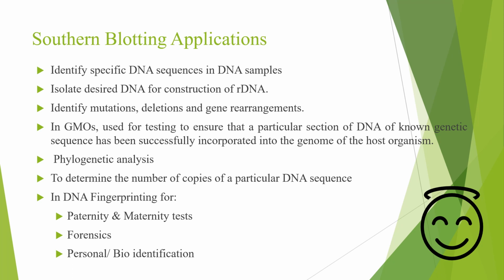In genetically modified organisms, it's used for testing to ensure that a particular section of DNA of known genetic sequence has been successfully incorporated into the genome of the host organism. It is also used for phylogenetic analysis. It is used to determine the number of copies of a particular DNA sequence.